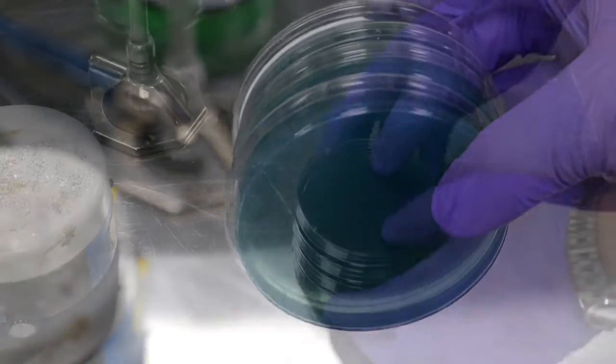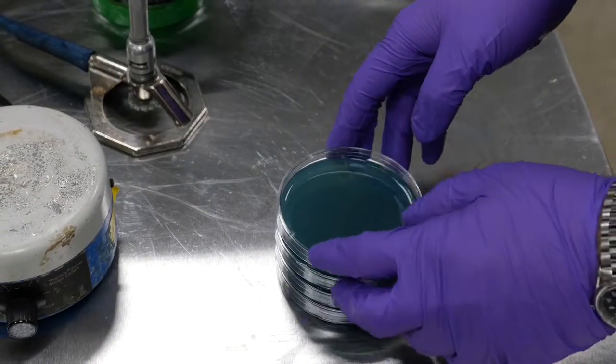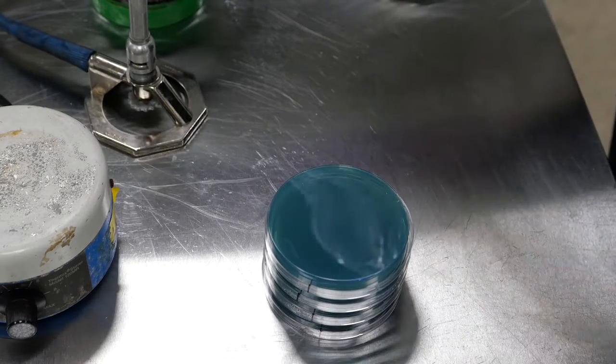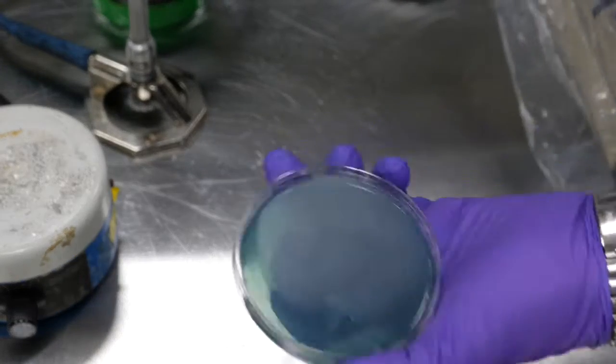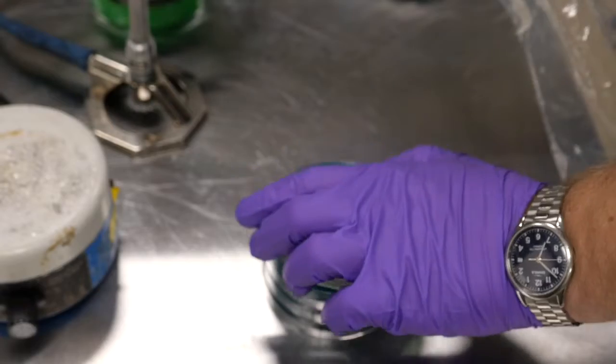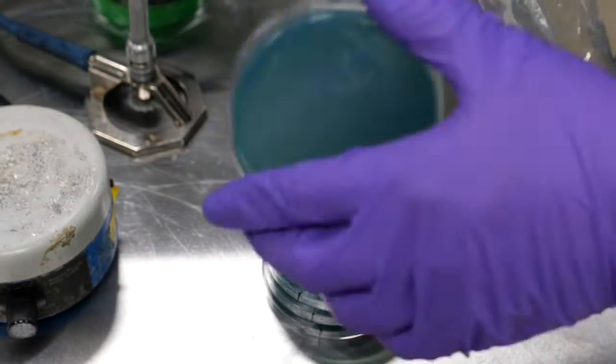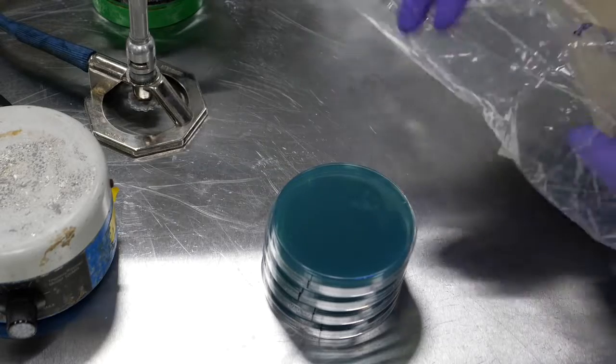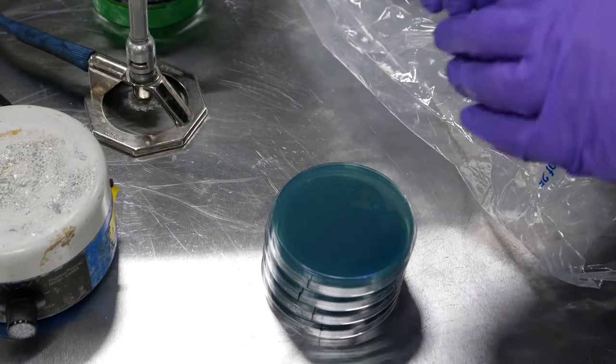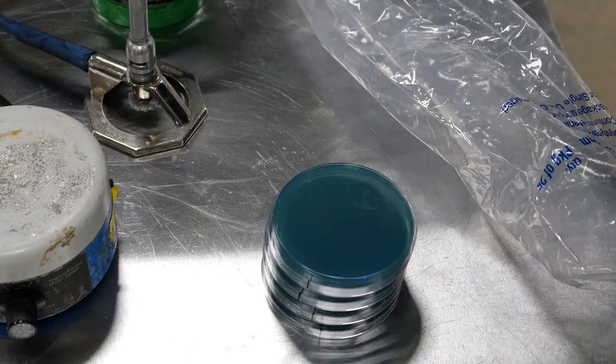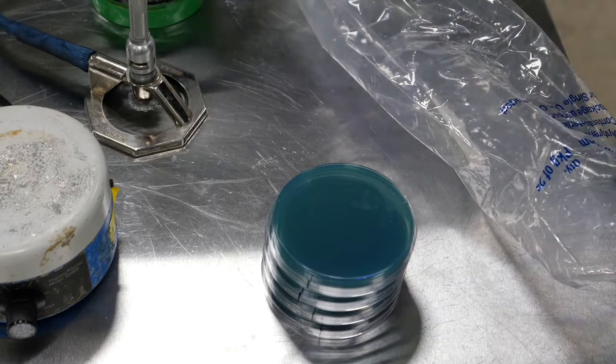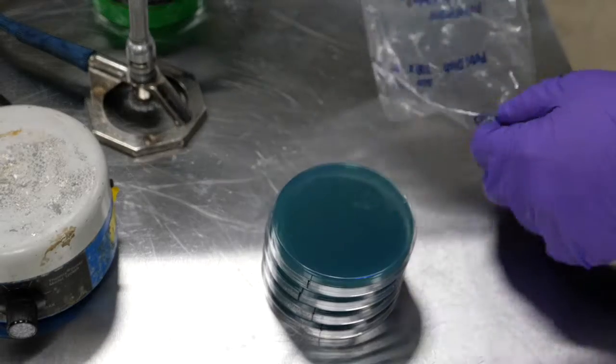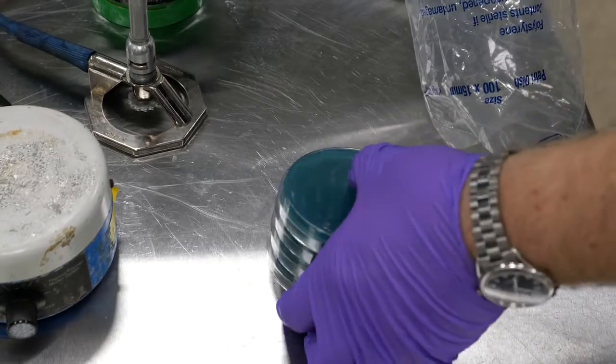So when the plates are fully solidified, what you want to do is store them bottom side up. This helps prevent any condensation from getting onto the surface of the agar because there will be some condensation when those plates solidify. I also do recommend holding these at room temperature for one or two days after pouring, just in case there has been any contamination. You'll be able to start seeing some microbial growth at that point. The last thing you want is a contaminated agar plate.